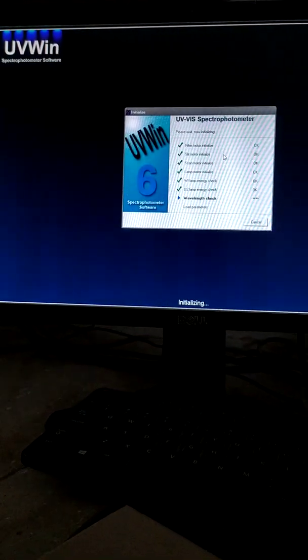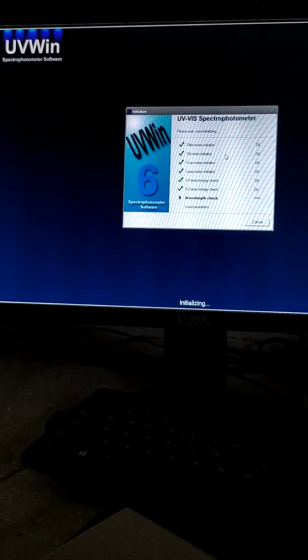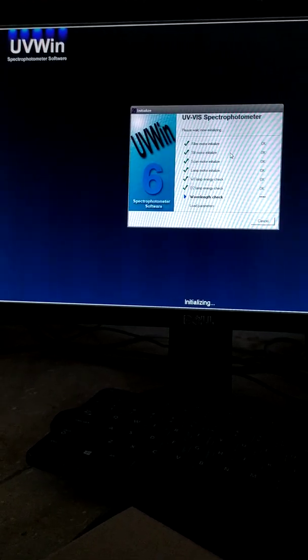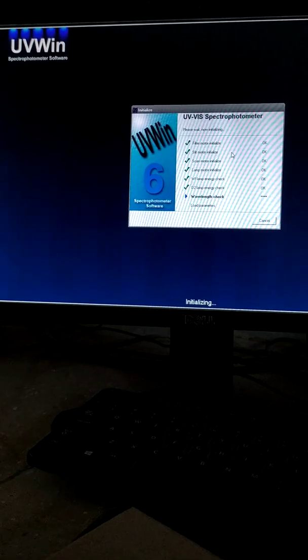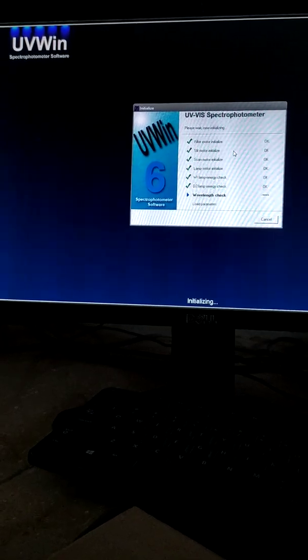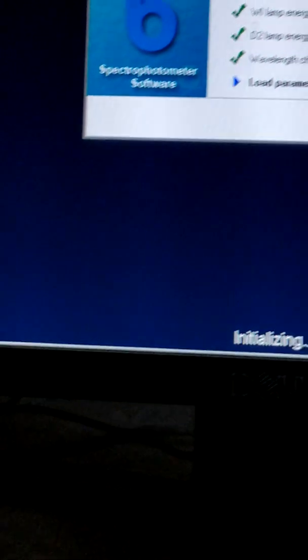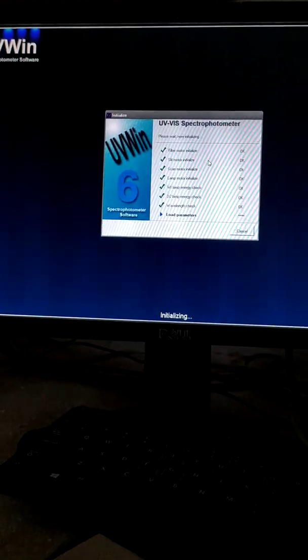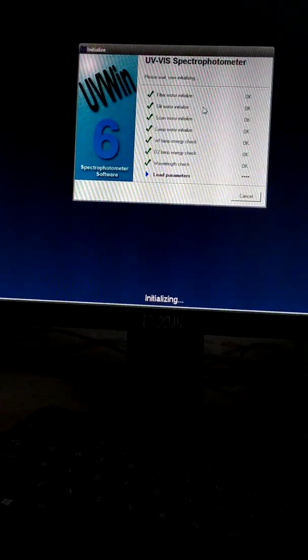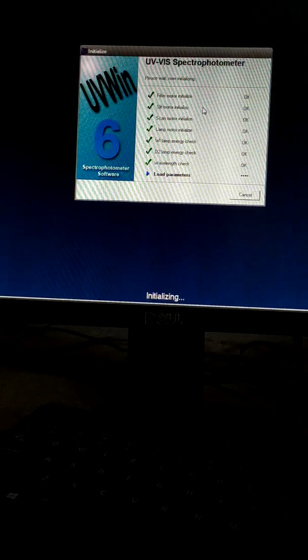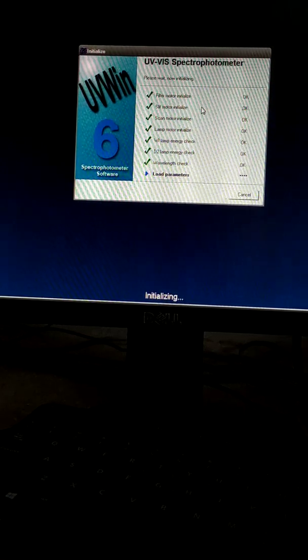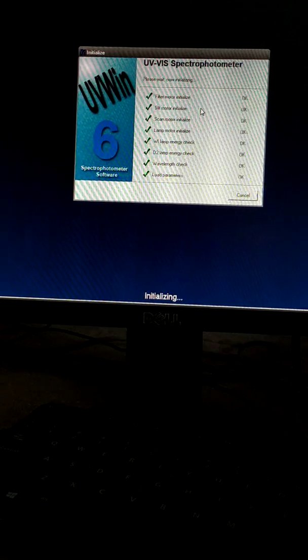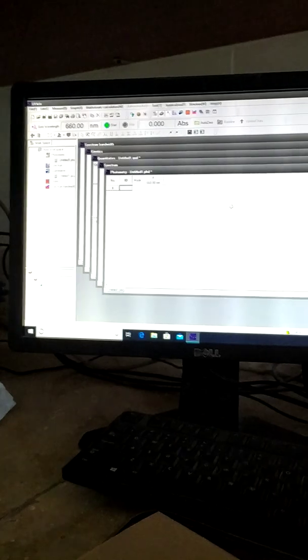It's almost done. Waiting for loading the parameters. Now the system is ready to use.